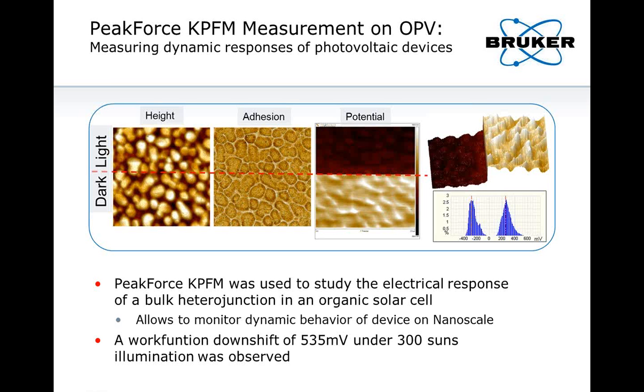So what we did here is we performed some PeakForce KPFM measurements on an OPV in order to study the electrical response when we illuminate the device with light. In this case, we use 300 suns with a sun simulator. And that's what we get. So you get height, adhesion. Remember, we use a PeakForce tapping experiment, so we always get nanomechanical properties at the same time. And on the right, we see the potential.